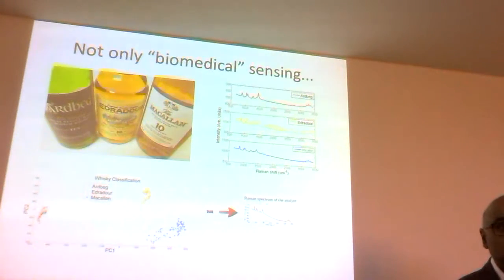Just a very short conceptual question, because I like to think in nanometers. When you show the spectrums on Raman shift, this is relative to the excitation wavelength, right? Correct. It's cm to the minus 1. 1 cm to the minus 1 is 30 gigahertz. So what are the nanometers? Right, so I could work that out for you. If you convert 30 gigahertz, it's okay.